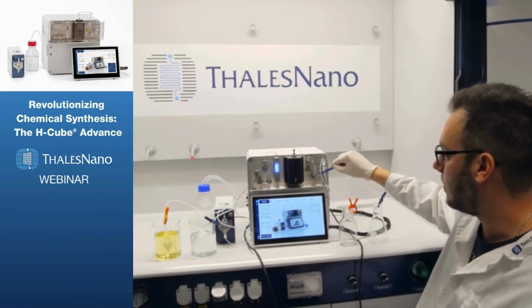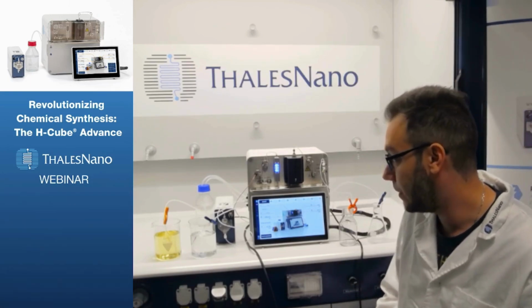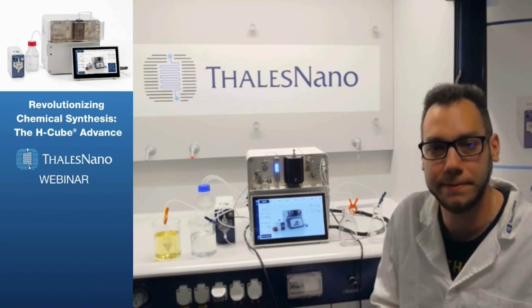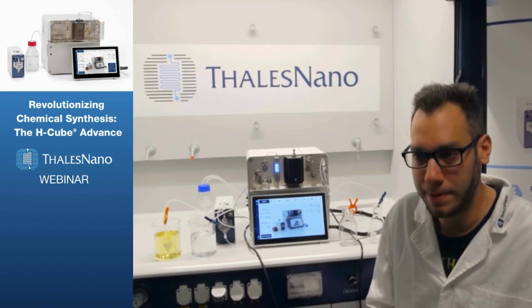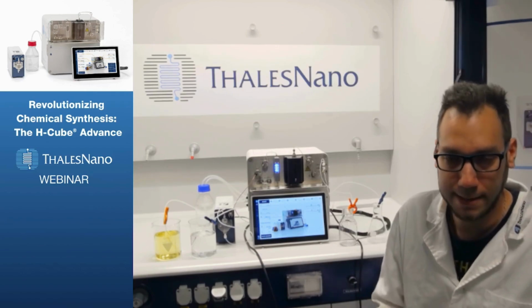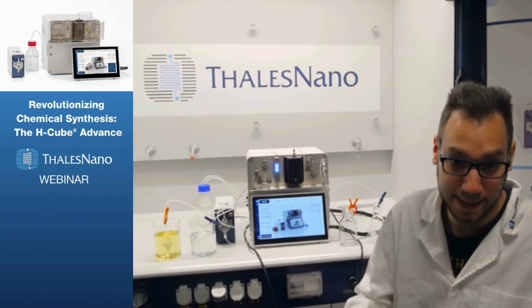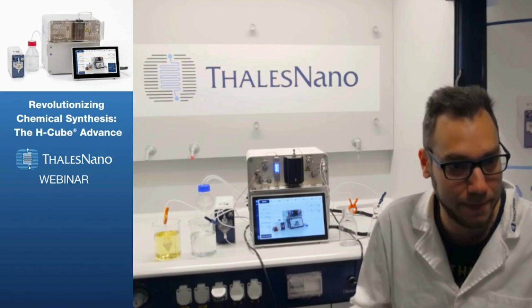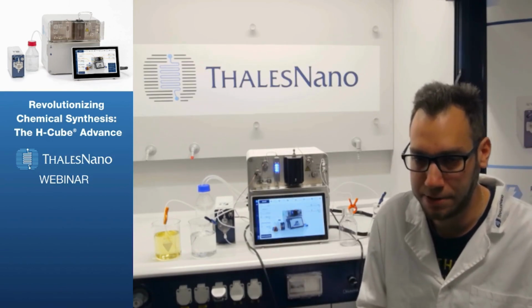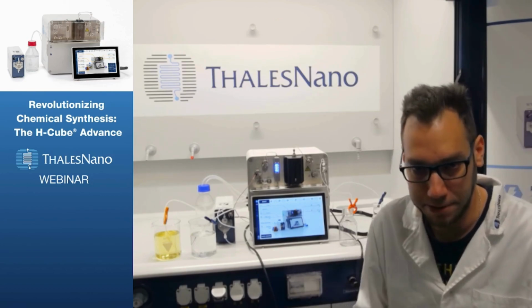And then there's, of course, the pressure regulator valve itself, which is responsible for building up all the pressure within the previous steps of the system. The maximum capacity of this pressure valve is 100 bars, and therefore the electrolysis cell is capable of maintaining 130 bars because it needs to overcome the pressure drop that we already talked about. And on top of that, it needs a little bit of extra pressure as well to allow for the breakthrough of the hydrogen into the system.